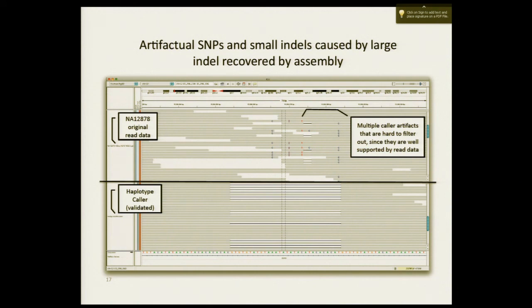So what you'll have is you'll come to the read, and you'll notice that at this particular location, all the reads past it have soft clips. And you're like, oh, that's very strange. And that's actually one of the triggers for deciding if a region is variable or not, is an excess of soft clips, right? And so then you can simply unsoft clip those reads, throw them into the assembly graph, and find these large insertions. So you actually can call large insertions. But for example, insertions which are larger than the size of the read, exactly. As they get larger and larger, then you don't have any reads mapping in the area, and then you're right, you can't do anything with this approach.